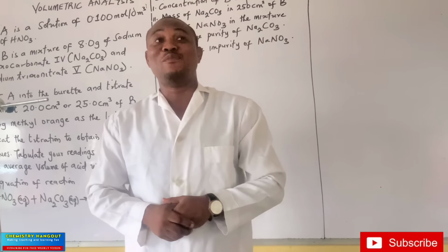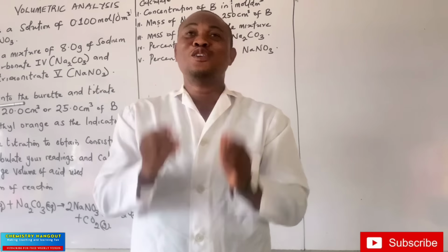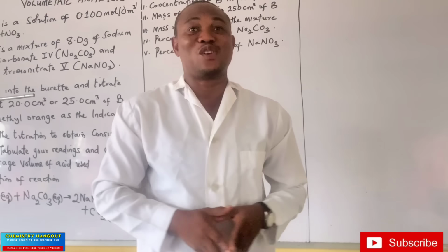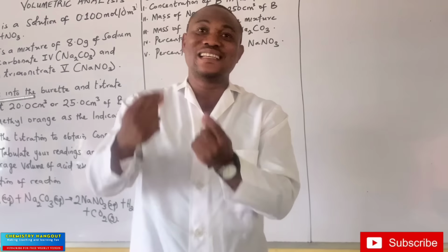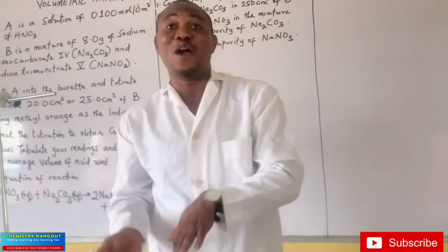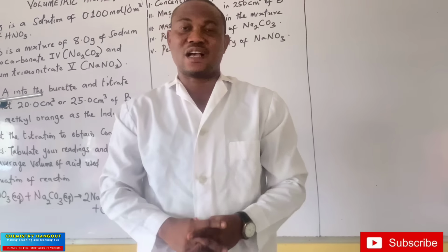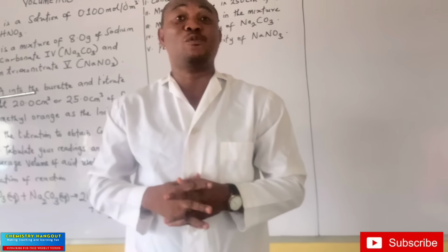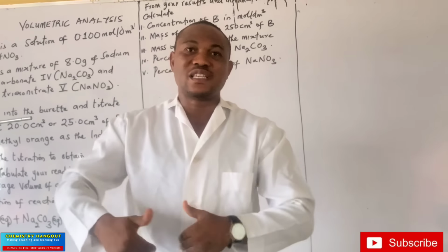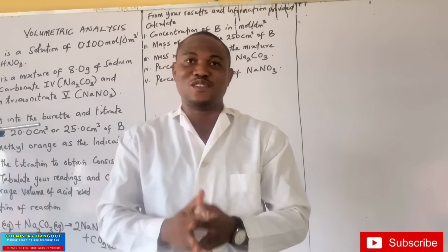So today I'm going to be doing the practical like we normally do. Just understand the steps. You are less concerned about the way they are bringing the question on that day. What you need to know is how these things are being done. They can change the question, they can decide to maneuver you, but if you understand all these things, you will still get the maximum mark for the practical. So pay attention very quickly. This is my own predicted question for the exam, like I always tell you, but you need to go about it step by step. You need to watch the video over and over again to understand what we actually do.